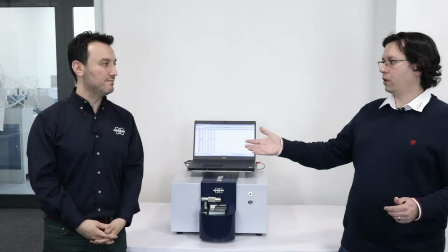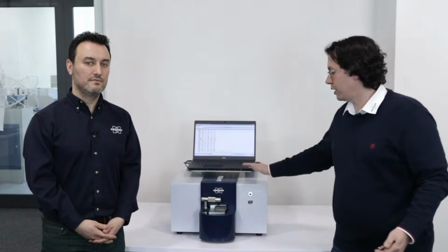This is really important, what you just mentioned. Yeah. We have different matrices that we work with here. So we can work with iron, aluminum, copper, and so on. And one really common question that we get here is, do I need multiple spectrometers to measure different matrices or different alloys? If I need to measure cast iron, or if I need to measure copper, do I need a different one? Can you explain?